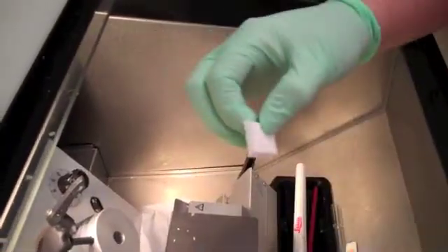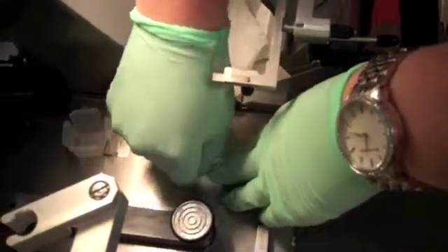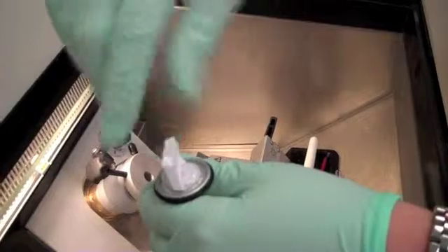Remove the block from its casing. Make sure you don't lose track of where the heads of the tadpoles or zebrafish are facing. Trim your block close to the heads using a razor. Then squeeze some OCT onto the chucks inside the cryostat and place your block in the OCT so that the embryos are upright. Let the OCT freeze before you proceed.